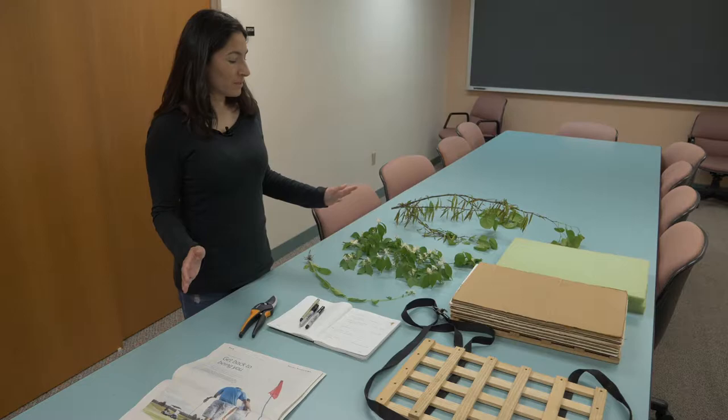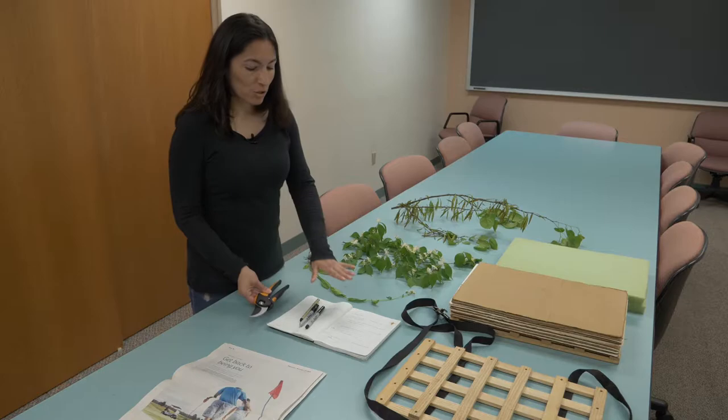These are the materials you need: your specimens, some clippers, your notes from your notebook, newspaper, and a press.